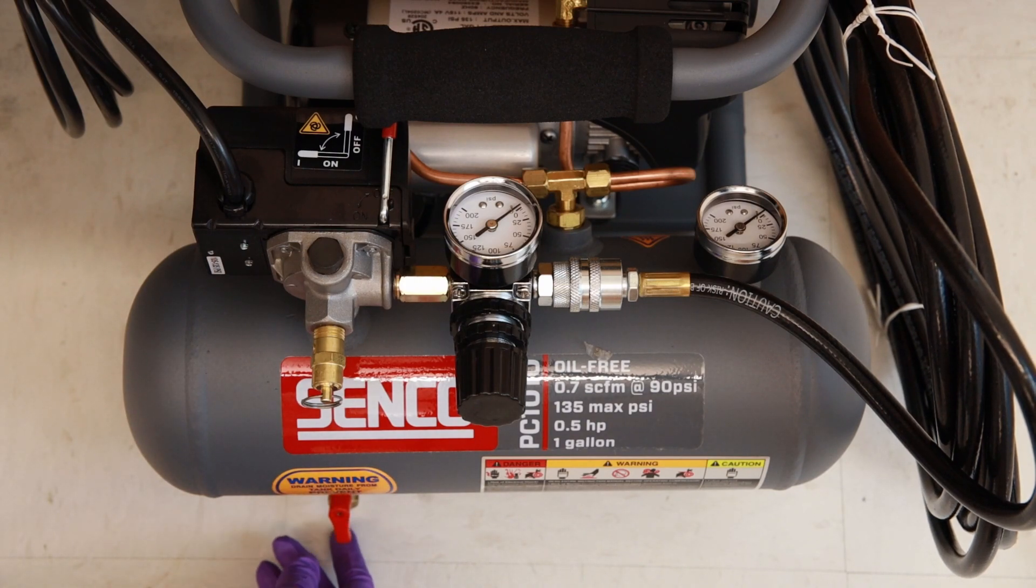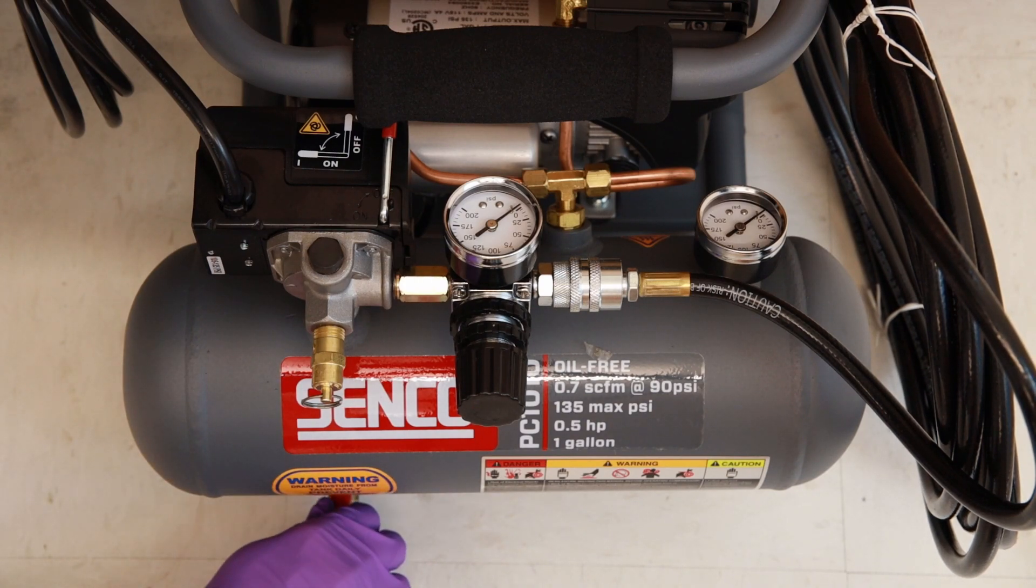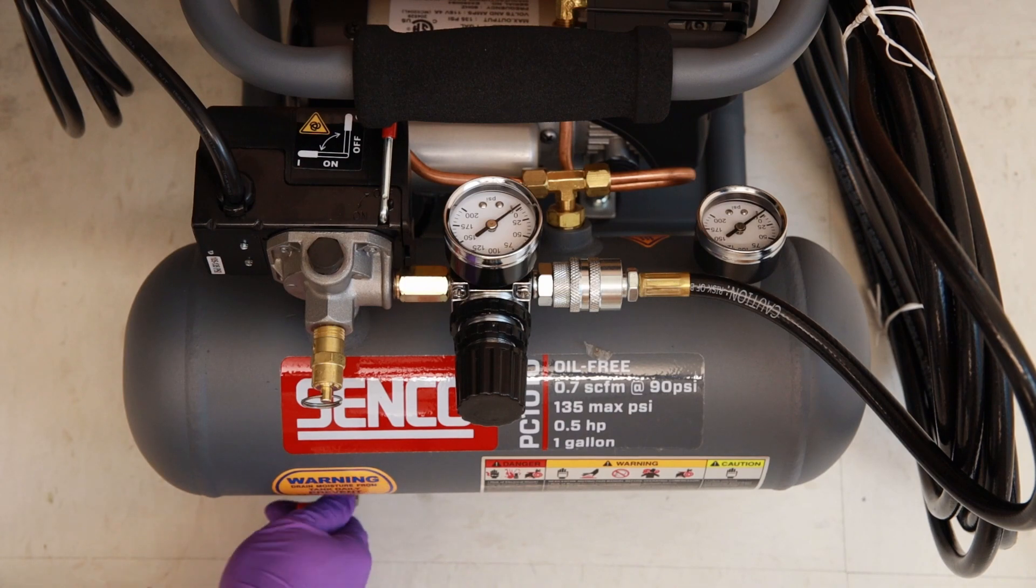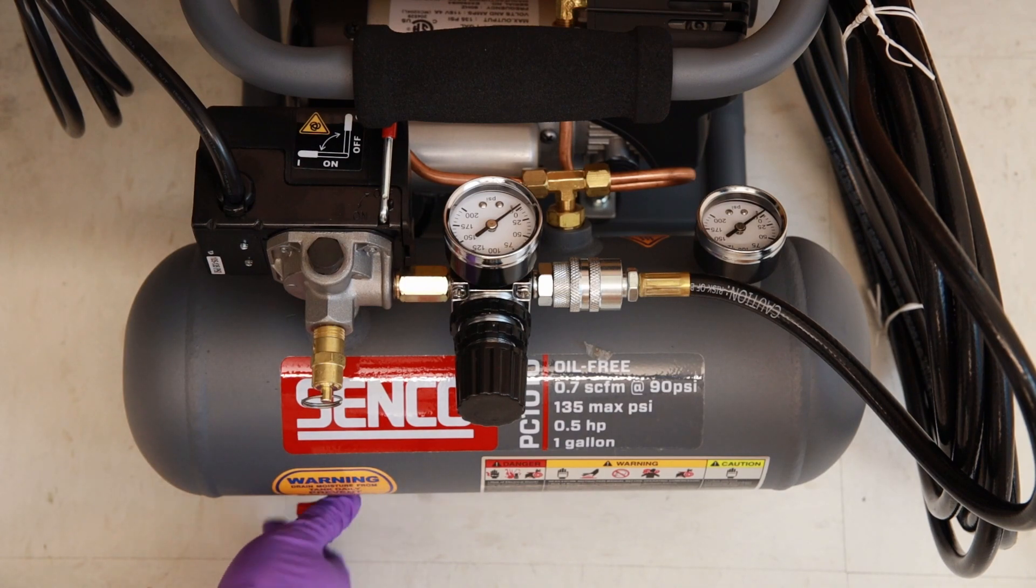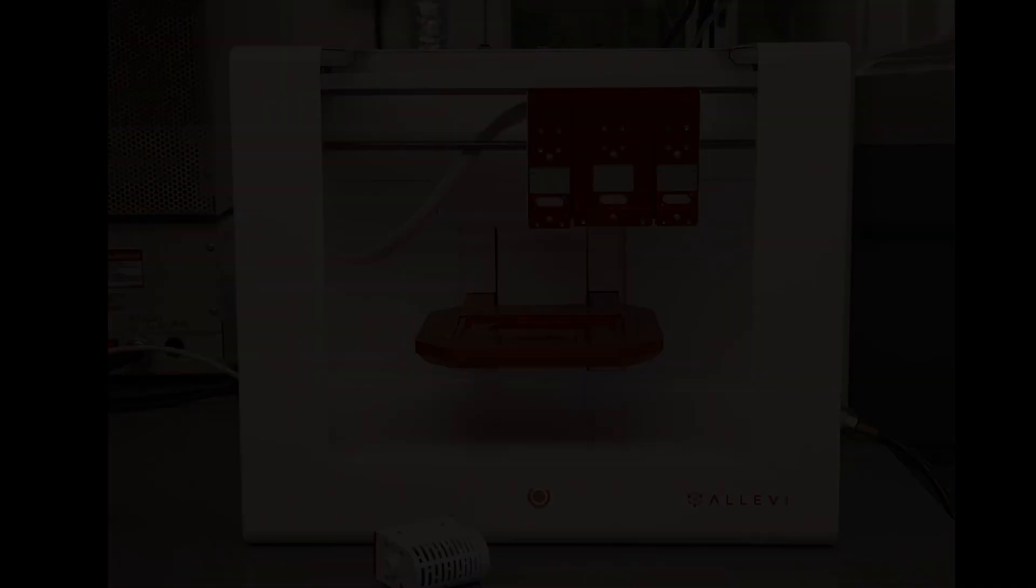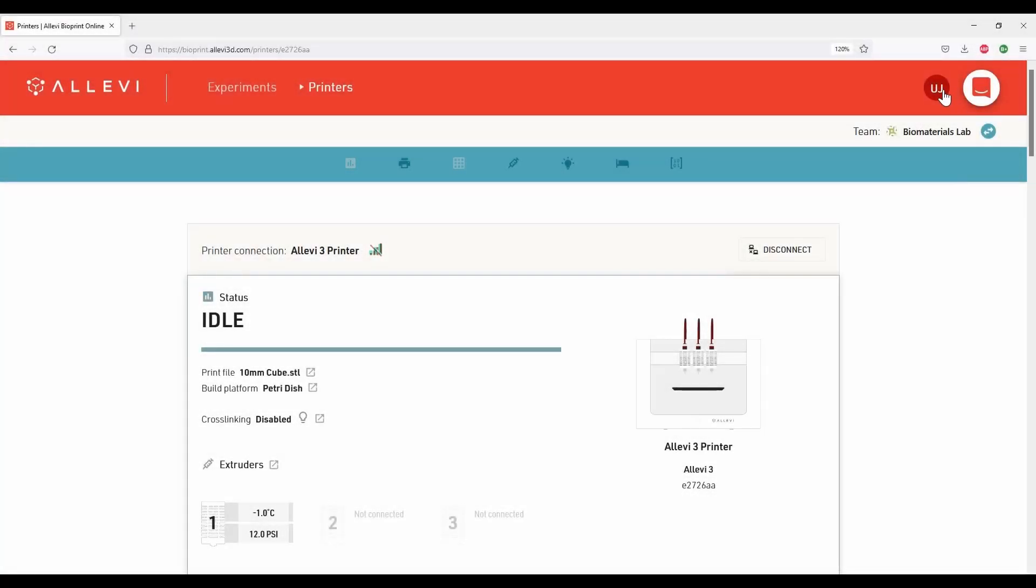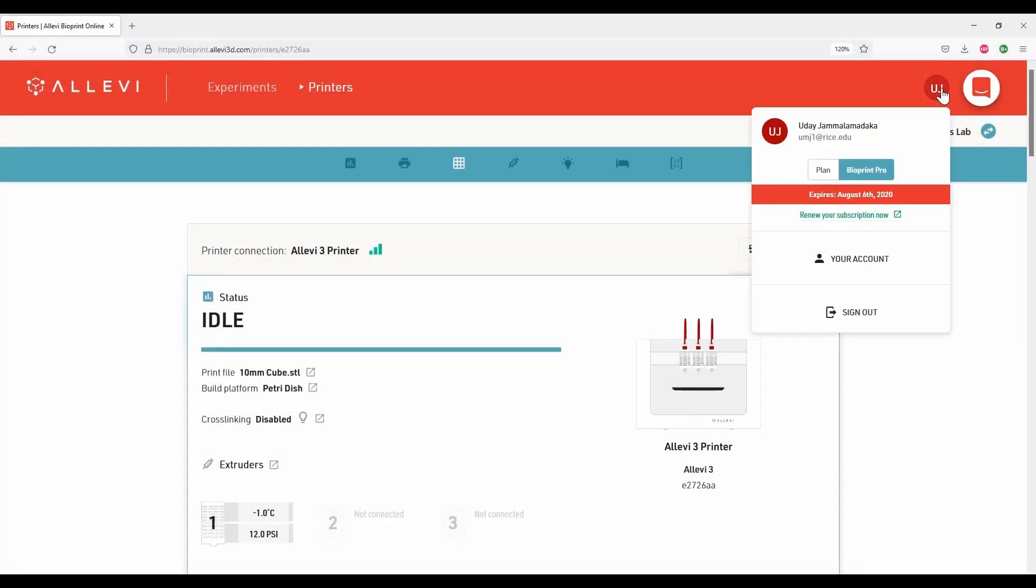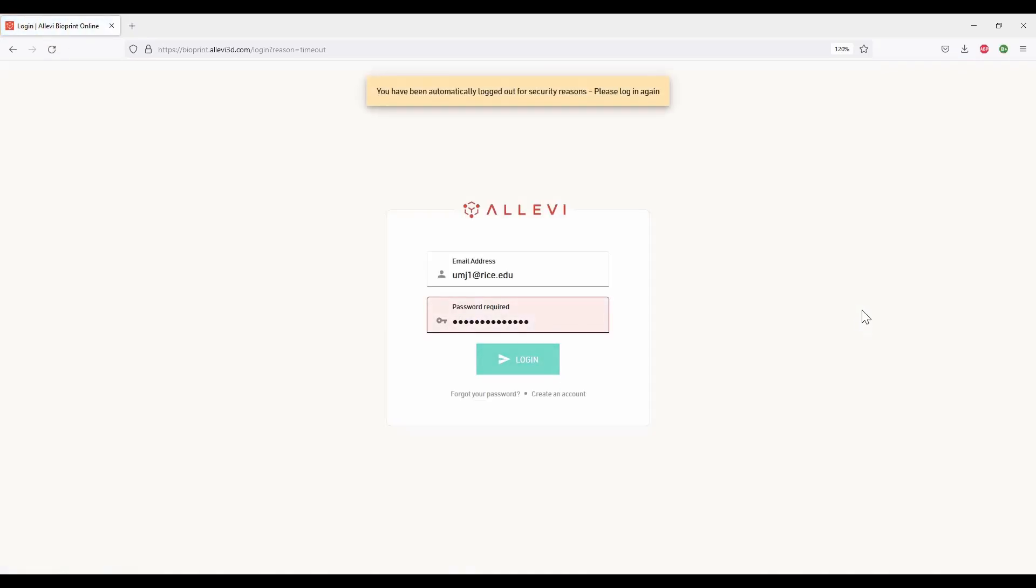Turn the valve to close position. Press the power button on the printer to shut down. Click on your name on the top right corner and click on sign out to log out of the application.